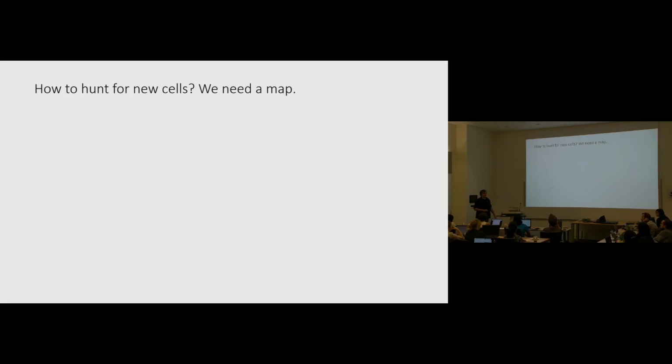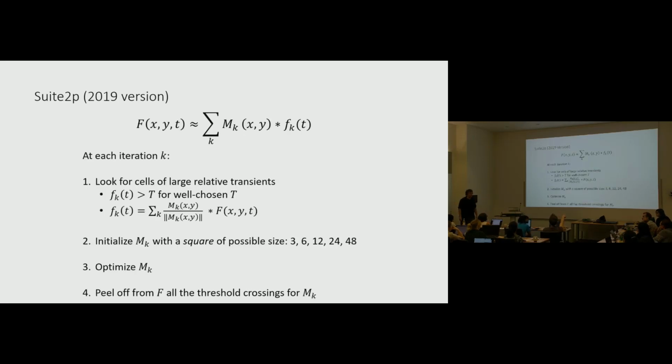Can I ask something? Yeah. So you're saying that you're estimating that size parameter? Yes. So what's the diameter or parameter that we have to tune ourselves? Yeah, so you could set that, you can impose that, if it didn't give you the right scale. It's now called spatial scale. Also, it used to be that in the older version of the algorithm, you needed to specify that yourself. It wasn't automatically detected, so the setting is still there.